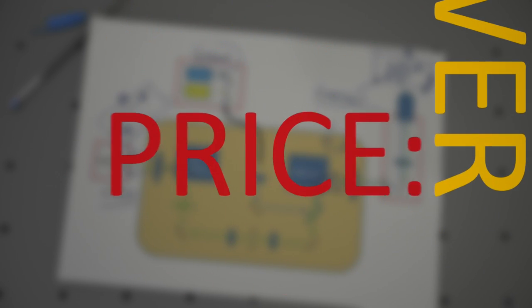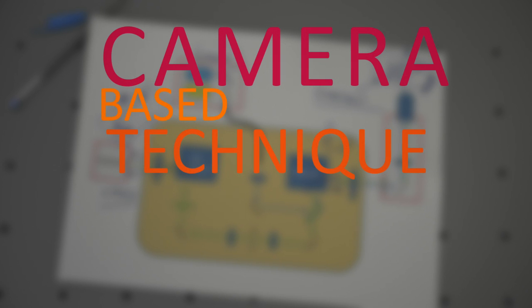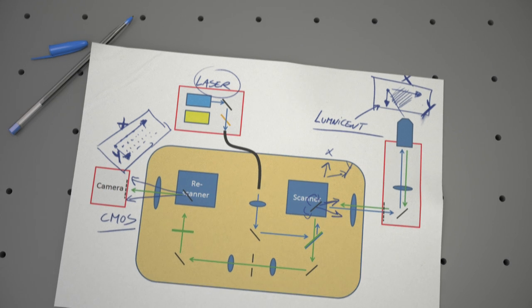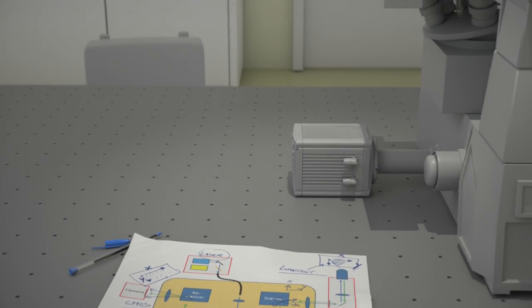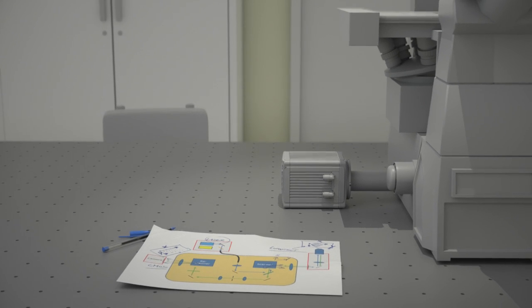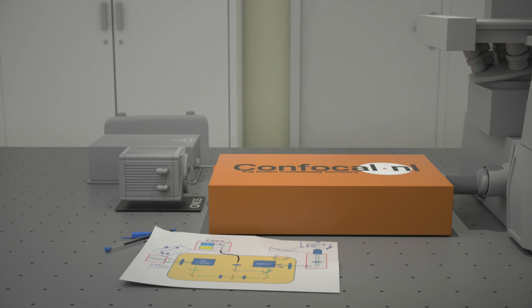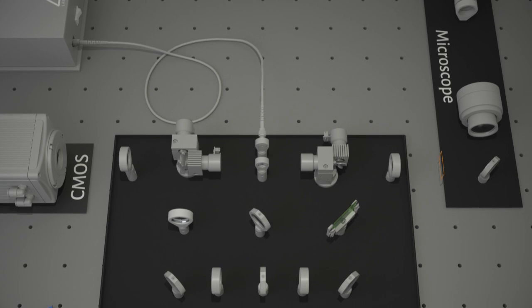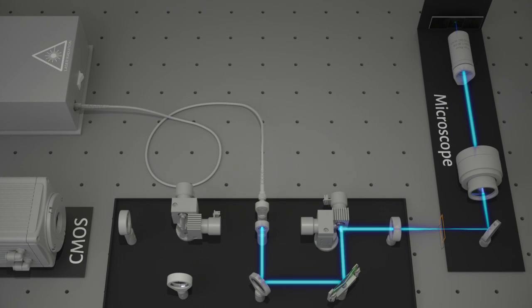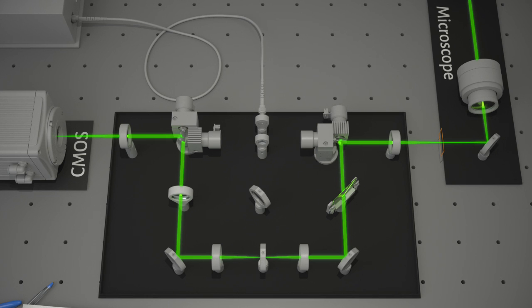A lower price. RCM is a camera-based technique without complicated electronics. This makes the RCM very affordable. The architecture of an RCM system is very simple, as it is connected with microscope and camera via a standard C-mount adapter. It is actually a box coupled in between your microscope and camera. The optics inside the box reads the object under the microscope and writes the information on the camera chip.